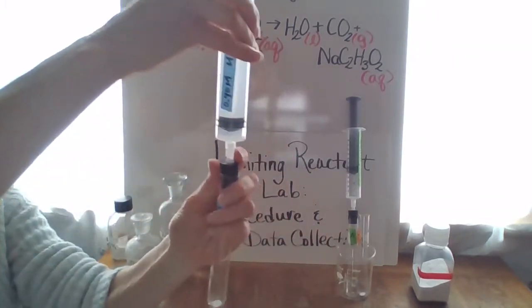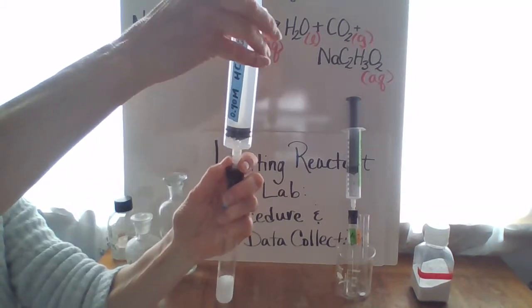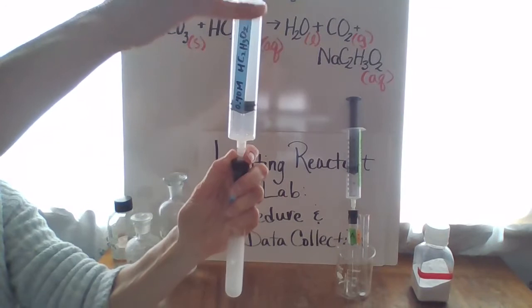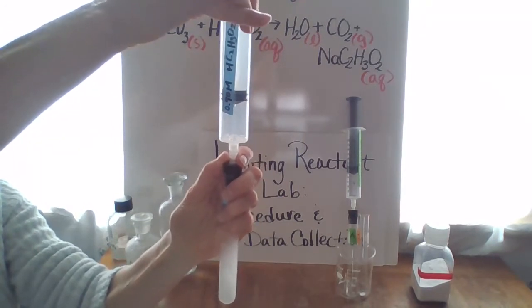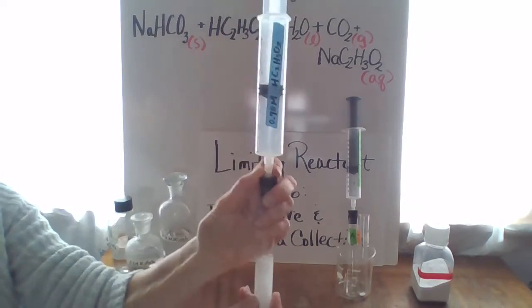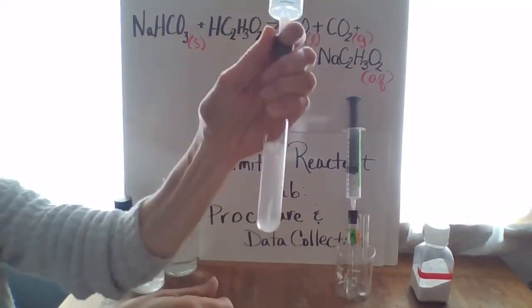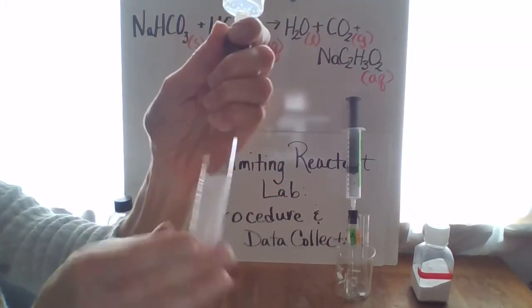This is the 0.40 molar acetic acid. I'm putting some of the acetic acid in slowly until all of it has been put into the reaction vessel. We can see some bubbling for sure.